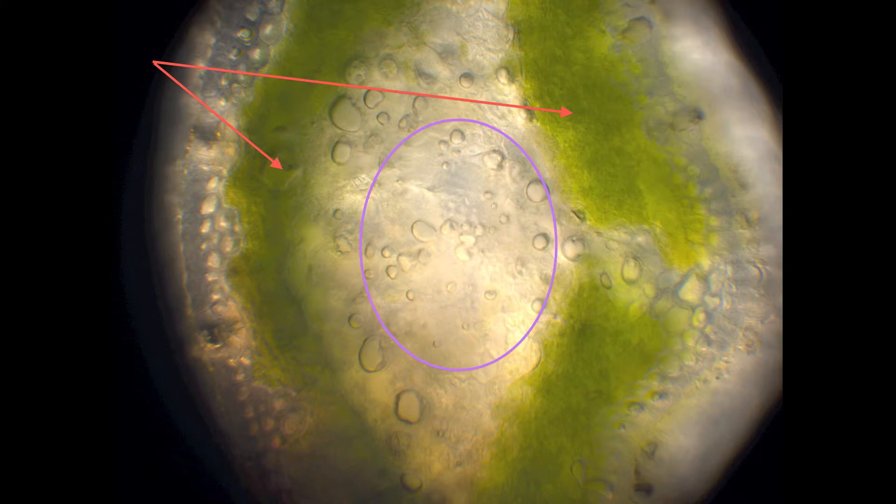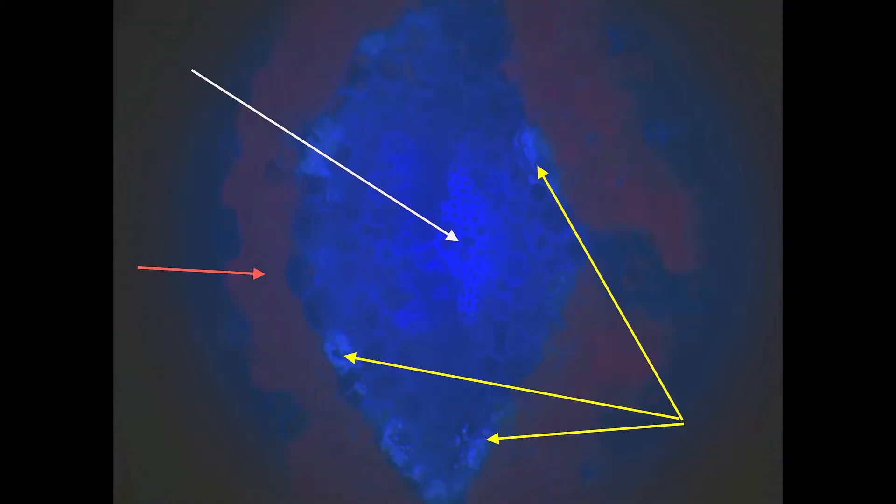Here's our specimen again, a little more magnified and rotated 90 degrees. Notice the oval showing some of the air bubbles that will vanish under the fluorescence and two red arrows for the chloroplasts which are green. Now when we go to fluorescence you see all of the air bubbles go away and the chloroplasts glow a bright red. We covered this before but just as a review the yellow arrows are pointing to the resin canals, the white arrow is pointing to the vascular bundle, and the red arrow is pointing to the red chloroplasts.